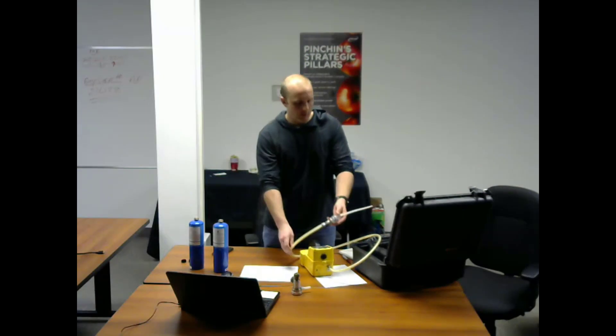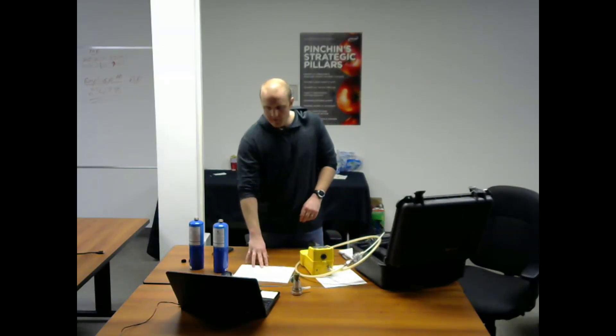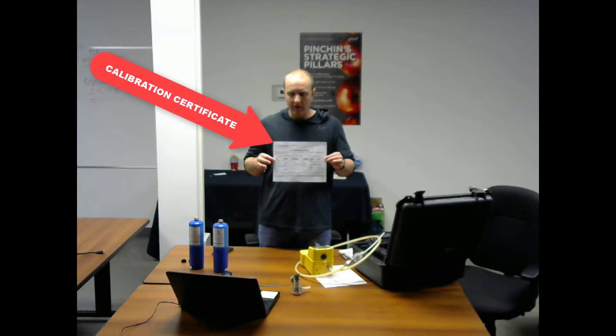While you're letting it warm up, make sure that you have a copy of the most recent calibration certificate with you and with your instrument. This demonstrates that a proper calibration has been completed on your Eagle and that it is operating the way it's supposed to.